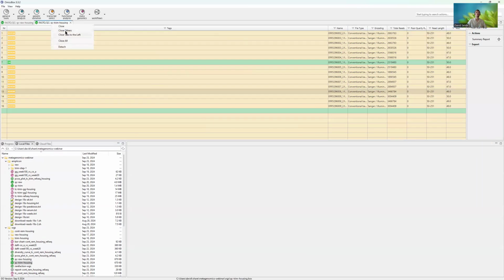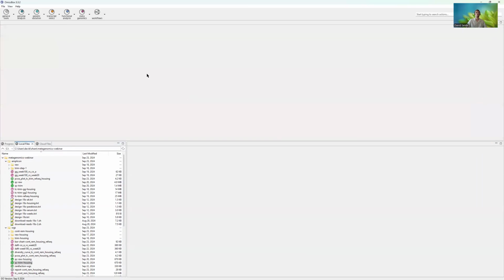We can go on with the next step, which I called quality control. I don't know where to put it, but yeah. If we're sequencing the whole genome with whole genome shotgun, we also get reads that belong to the mouse genome, because we're sequencing the mouse gut.